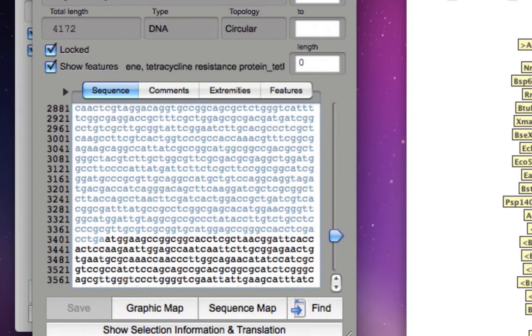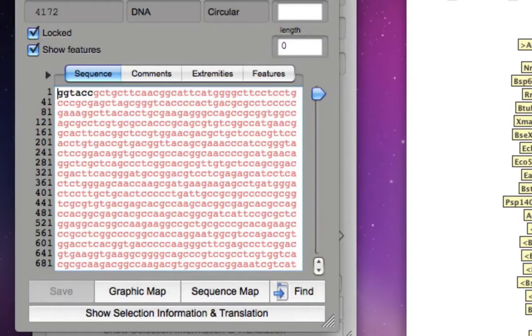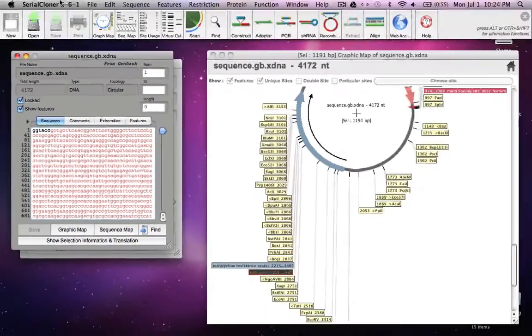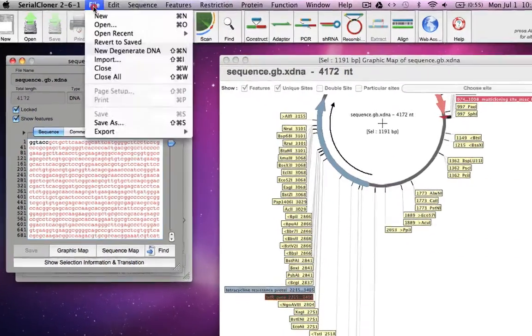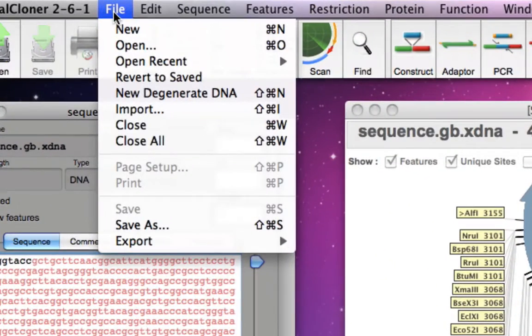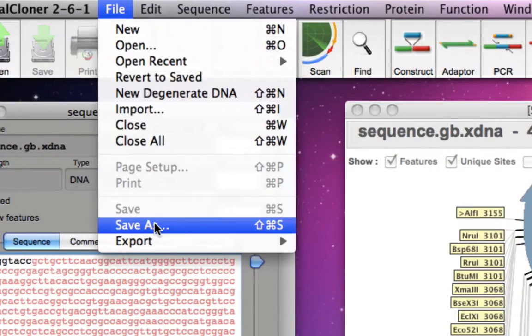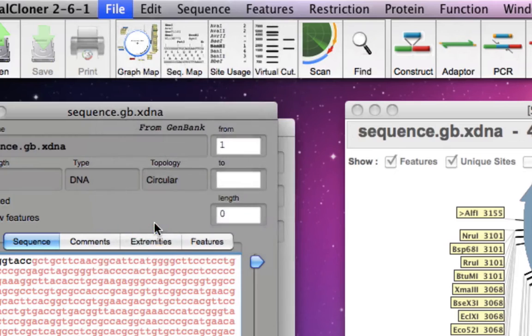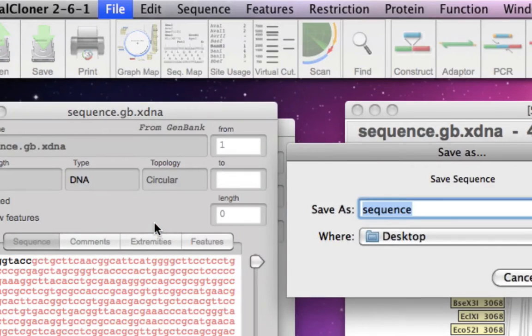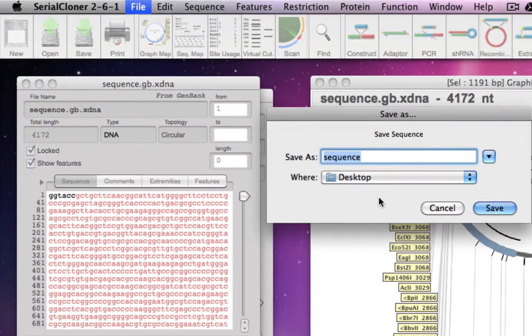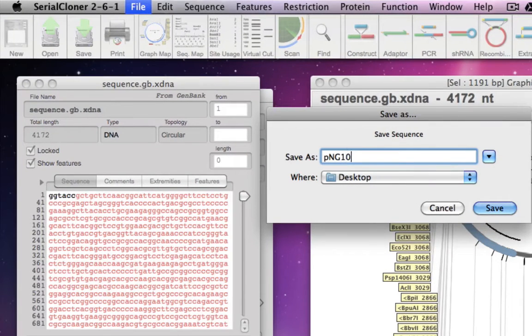Now you would like to save this sequence so that you can use it in future. Just hit Save File, then Save As, and just put the name you would like, let's say PNG10A, and save it.